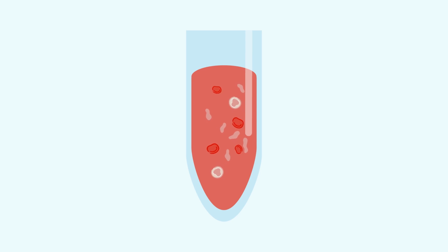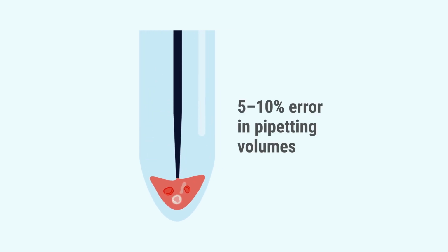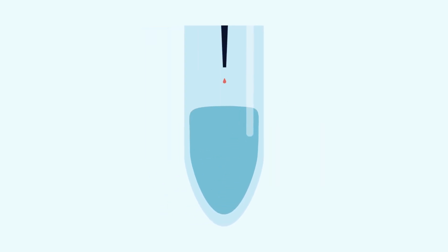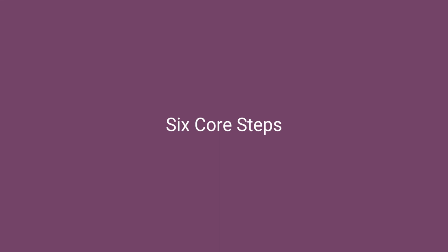For example, consider optimizing liquid handling for whole blood samples. Because the samples are typically viscous, a 5 to 10% error in pipetting volumes may be an acceptable performance compromise, but dripping that contaminates other samples is not.